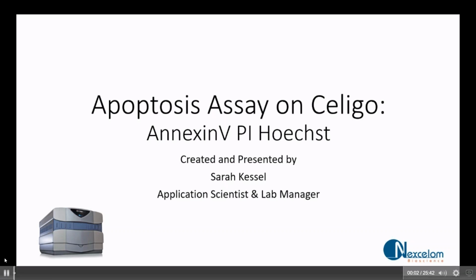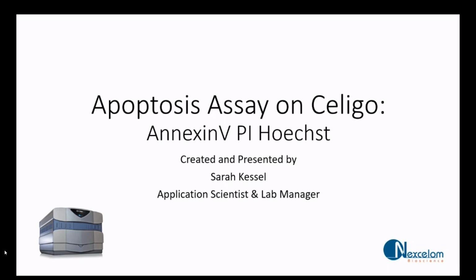Thanks, Amy. Hi, everyone. Welcome. I'm really excited about today's webinar because this reagent has been around forever, but it's typically run on a flow assay where you have to trypsinize your cells out of the plate, and it's just complicated. You lose cells and so forth. So if you tried the image-based version on some of these vendors that are supplying it, you have to do some washing. So what I've done is I've taken some of the reagents available in the market, and I've tweaked the recipe a little bit so you don't have to do any washing. So I'm excited to show you this assay.